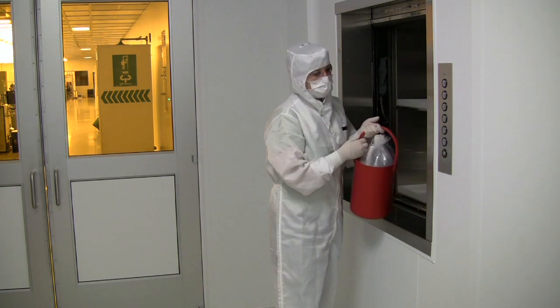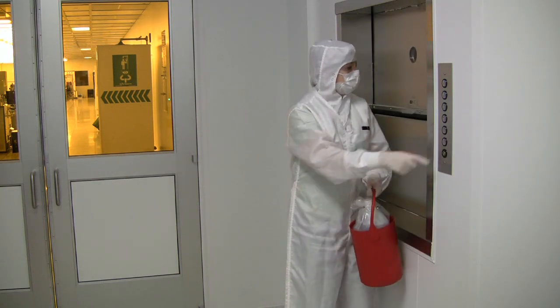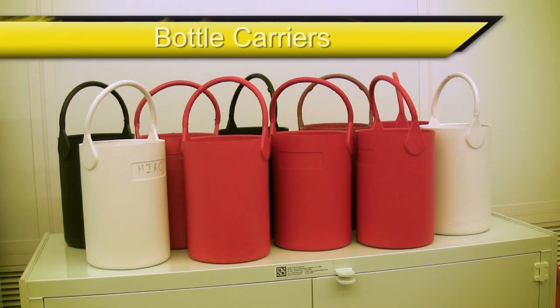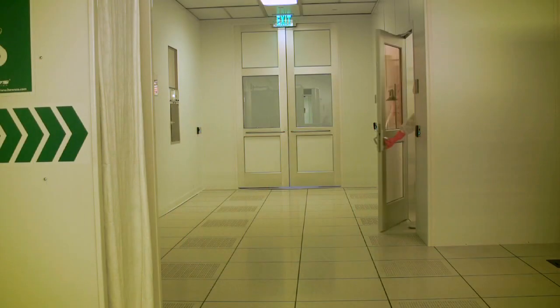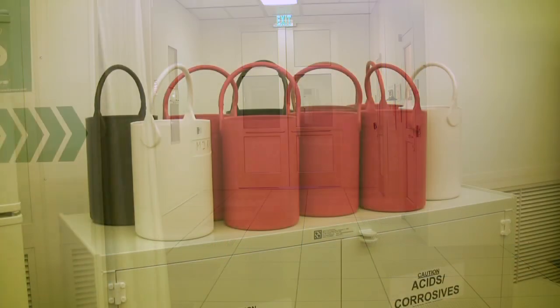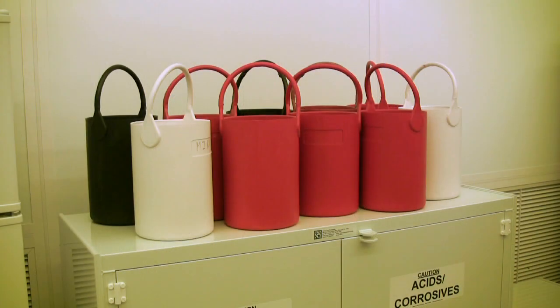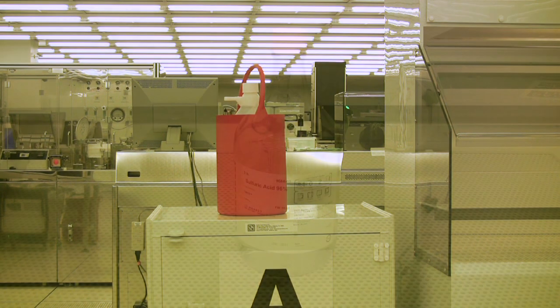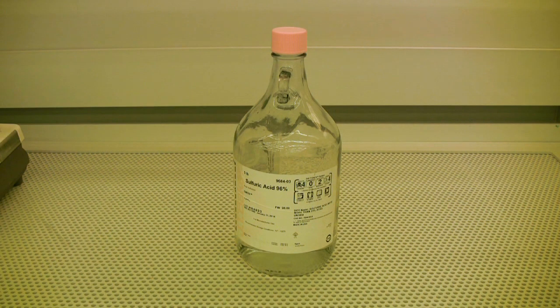Regardless of the type of chemical or the size of the bottle, whenever you are transporting a chemical from one location to another, it should be done using a bottle carrier. Bottle carriers lessen the chance for a bottle to break or be punctured during transport and can also help contain a leak if the integrity of the bottle or cap is compromised. Bottle carriers are kept in the cleanroom supply storage area and can usually be found next to the chemical storage cabinets as well. Chemical bottles should also never be left on the floor, to prevent them from being accidentally kicked over — when a bottle is out and not in use, it needs to be on an elevated surface like a table or inside the fume hood.